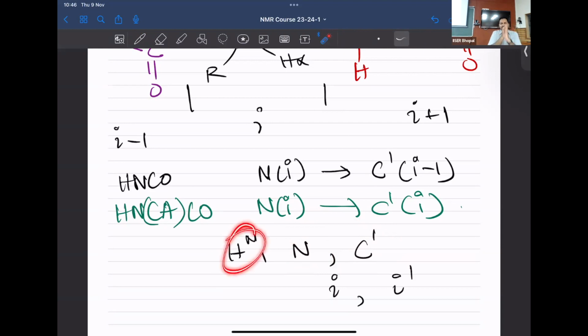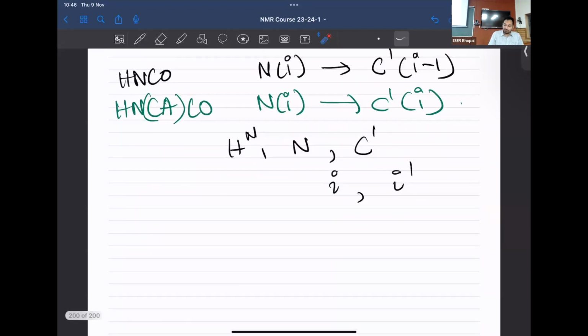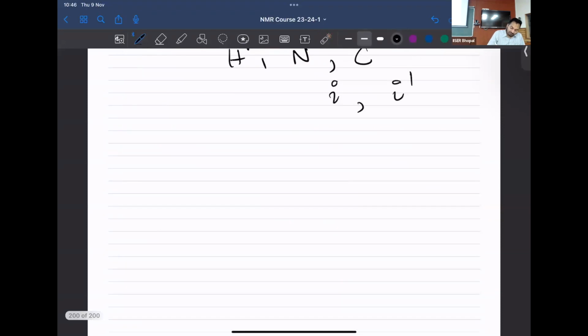The proton will help you detect small differences because you can get a high-resolution proton, provided you have the sensitivity for it, right? This is also a place where, remember, we are not stuck with only these three nuclei. I'm happy that you raised it. Therefore, we can have better experiments. What are the better experiments?